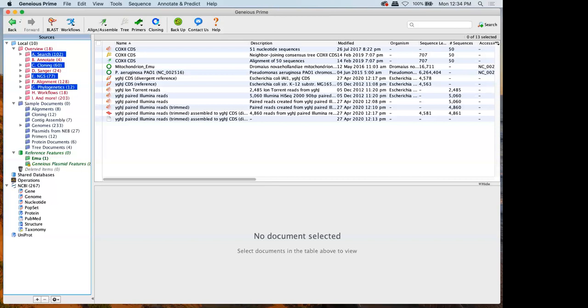We also have a Galaxy server running at Tufts, which is kind of a hybrid between something like Geneious and the full cluster experience, because it has a graphical user interface but actually uses the cluster on the back end. We have the ability to install a lot of open source tools and even in-house developed tools there. So there are lots of options. If you have something that outgrows the Geneious program, but you have a workflow that's working for you and you'd like to move, then reach out and we'll figure out how to set it up.